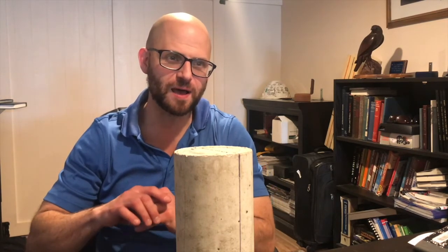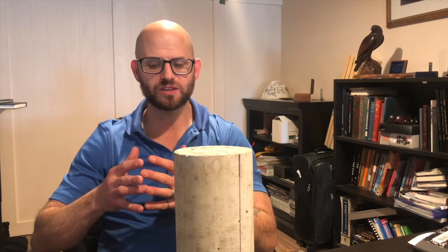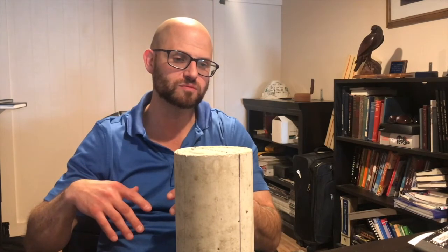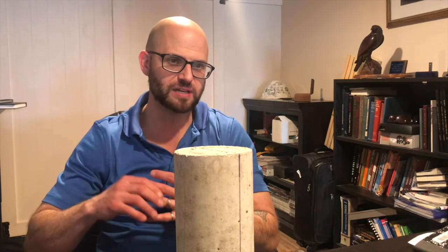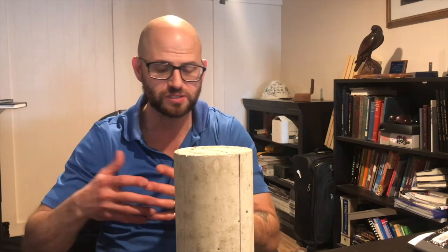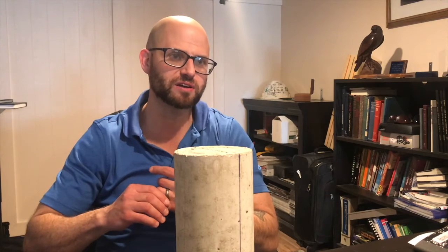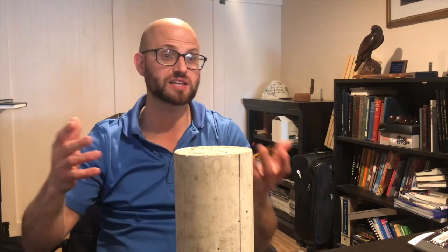Wanted to talk today about scanning electron microscopy. Scanning electron microscopy is a technique used throughout a lot of universities, throughout the academic arena, to look at what the eye can't see. It's great for metals, it's great for carbon fibers. Now with new types of chambers, you can do nonconductive materials. You can do waters or stuff with fluids in it. But we're often asked, and today we had the conversation, is scanning electron microscopy valid for the practical world, for selling commercial products?